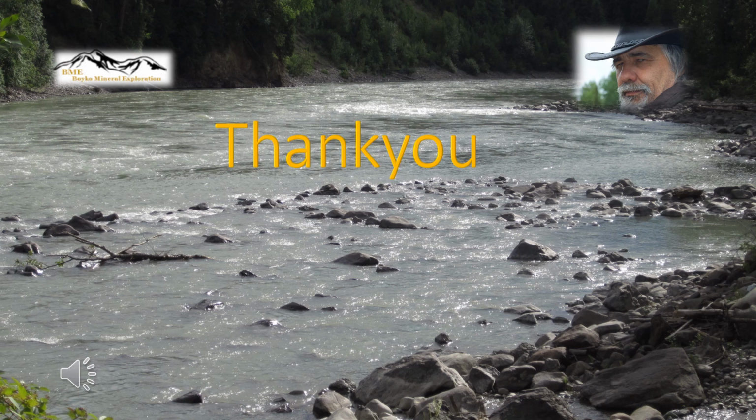In the next presentation, I will be digging deeper into the reducing and oxidizing powers of the material that I have just covered in the last few presentations. And I will also be discussing some of the intricacies regarding crucible fusion.